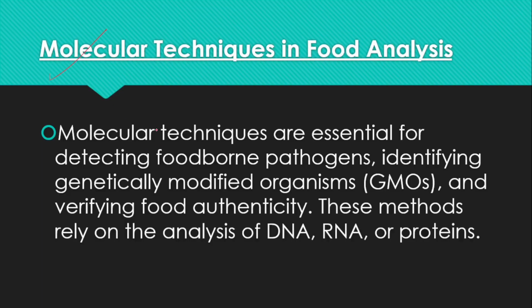Coming to the molecular techniques in food analysis, it is essential for detecting foodborne pathogens, identifying genetically modified organisms and verifying food authenticity. And these methods rely on the analysis of DNA, RNA or proteins.